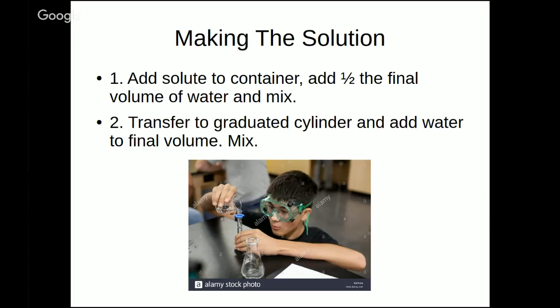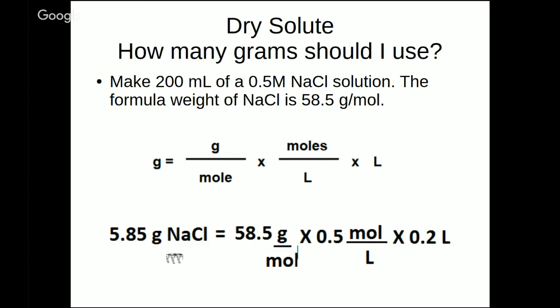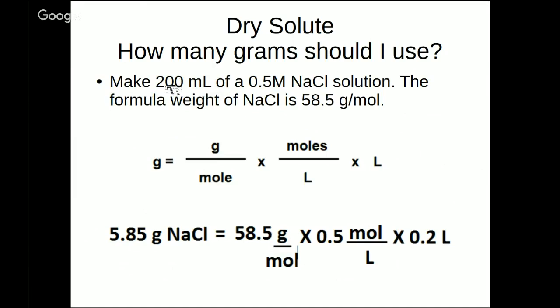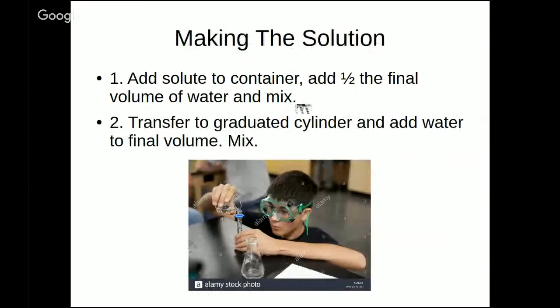Now I've done the math. How do I actually make the solution? Well, the first thing you're going to do is you're going to measure out your salt. In this case, I'm going to measure out 5.85 grams of my salt. I'm going to put that into some kind of container. And to that salt, I'm going to add water. And I'm going to add about half the final volume of water. So in this problem, I wanted to make 200 mL. I'm going to add about 100 mL of water to the container and mix it. This just gets it started dissolving before you're up to your final volume.